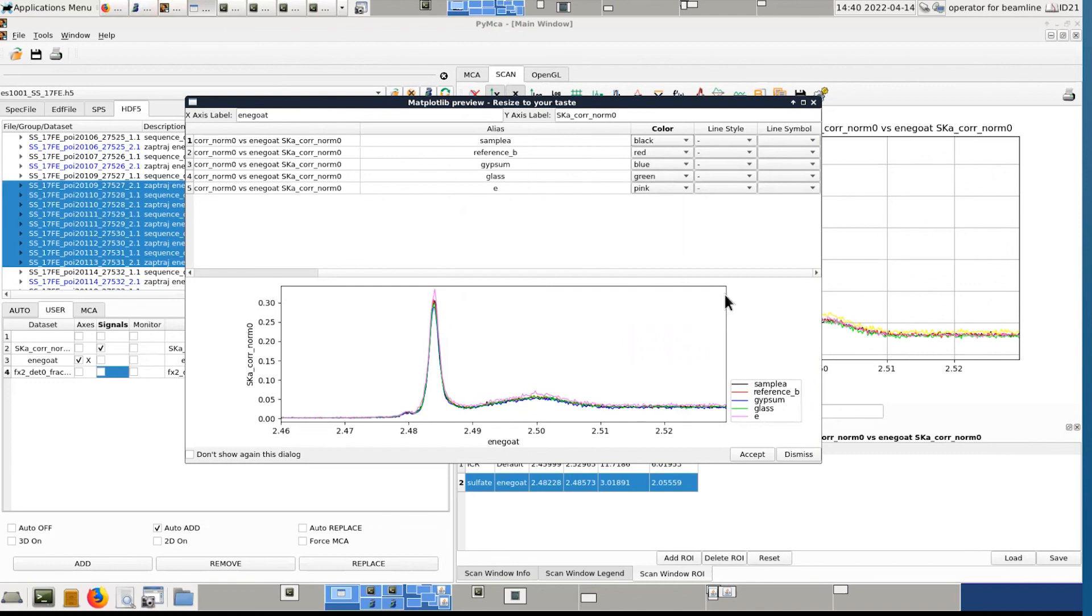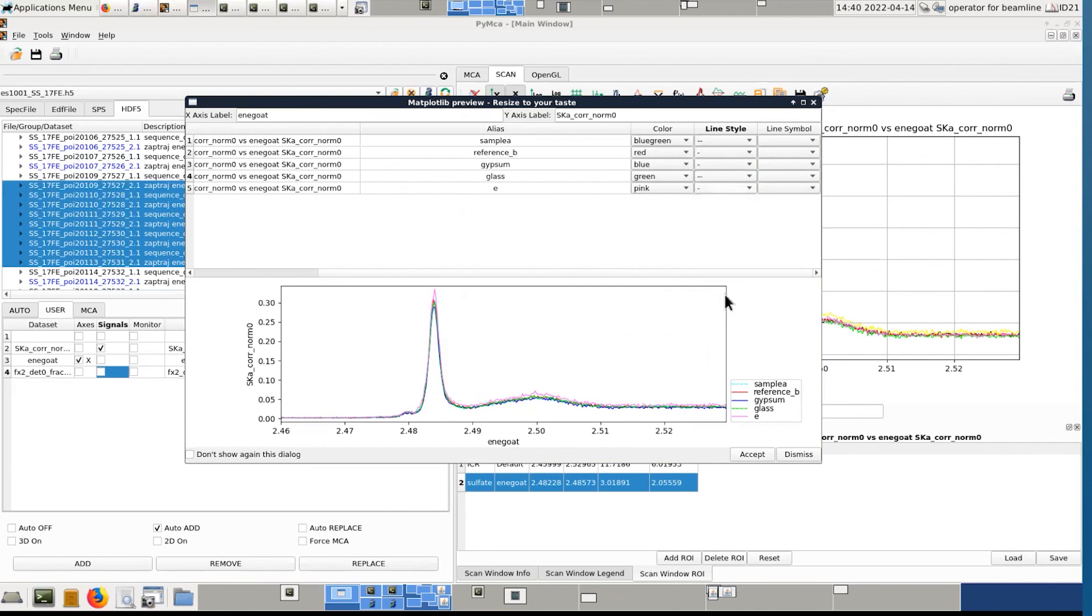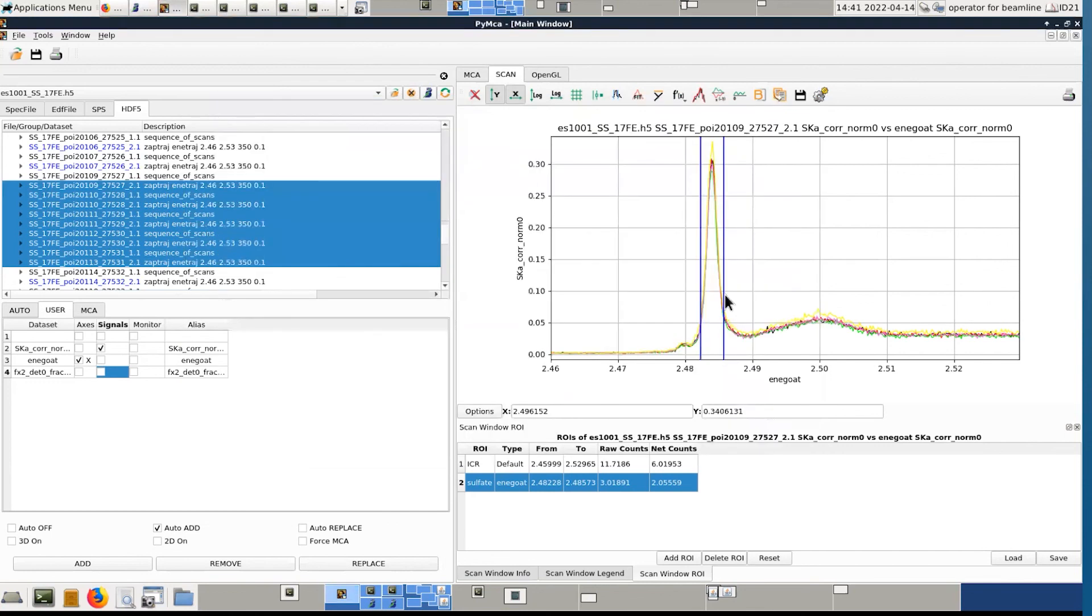You can change the color yourself. You can change the style of the line. One by one. The line symbol as well. And that's it. So, and this way you have somehow something that you can put in a report. Then you click on accept if you are happy with the results.